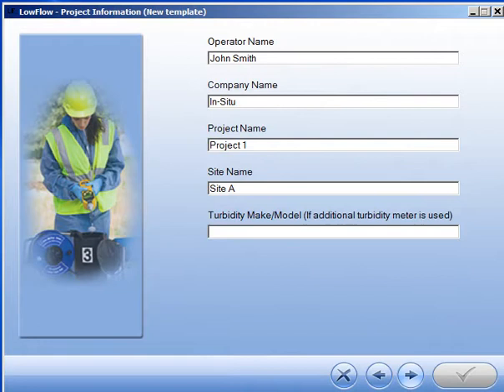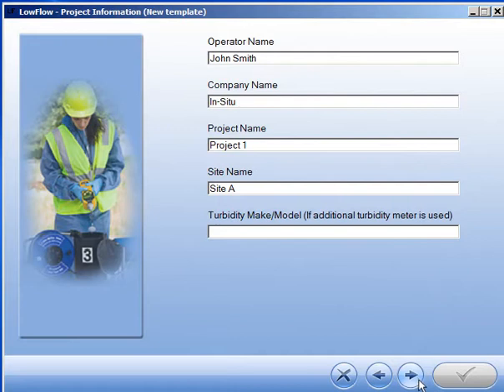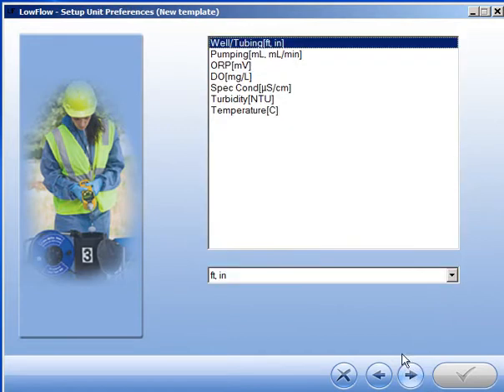The Project Information screen is where you enter information specific to your project. The SmartTroll does not include a turbidity sensor, but if you are using a third-party sensor for this project, enter the information here.